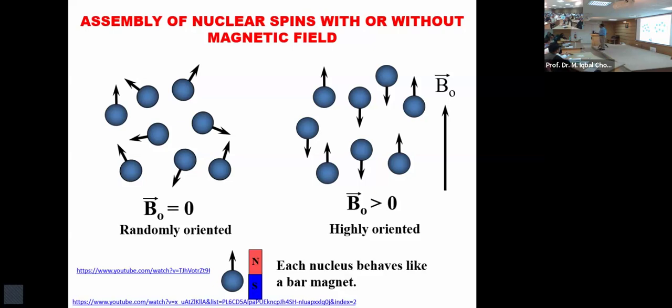No electromagnetic radiation can be absorbed without an energy difference. If there is no energy difference, no absorption of radio frequency or any radiation per se. UV, IR, nothing would be absorbed unless there are energy states. So the first thing that happens when you place your sample in the permanent, ever-present magnetic field is the defining of energy states. And when energy states are defined, you can bring radio frequency, you can absorb radio frequency.